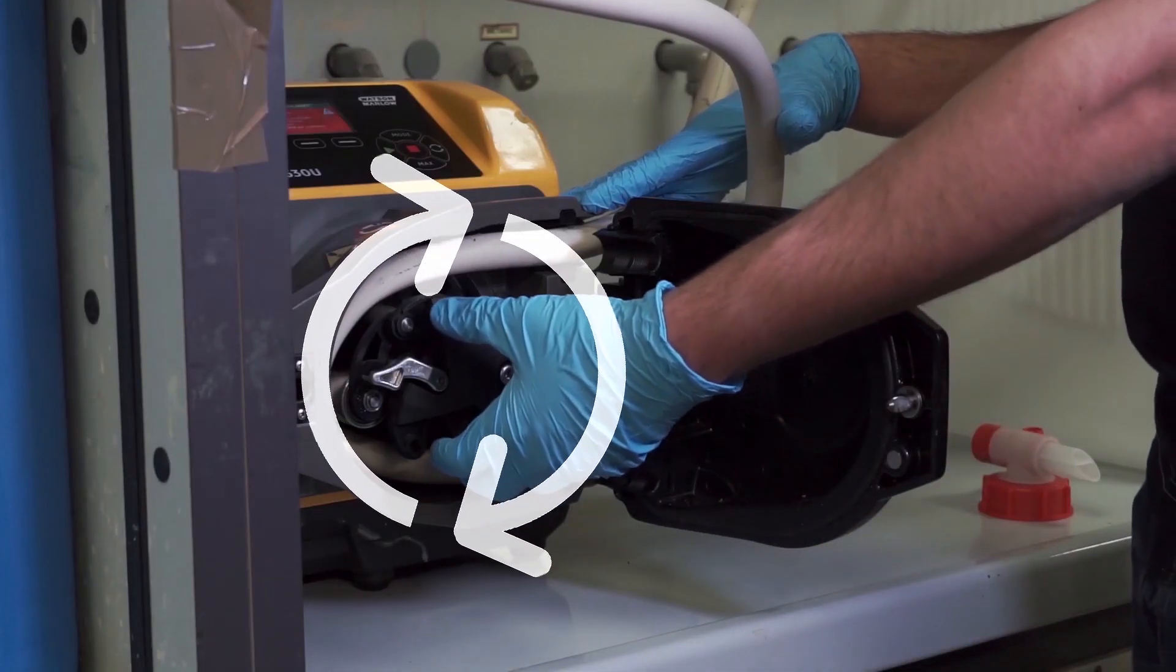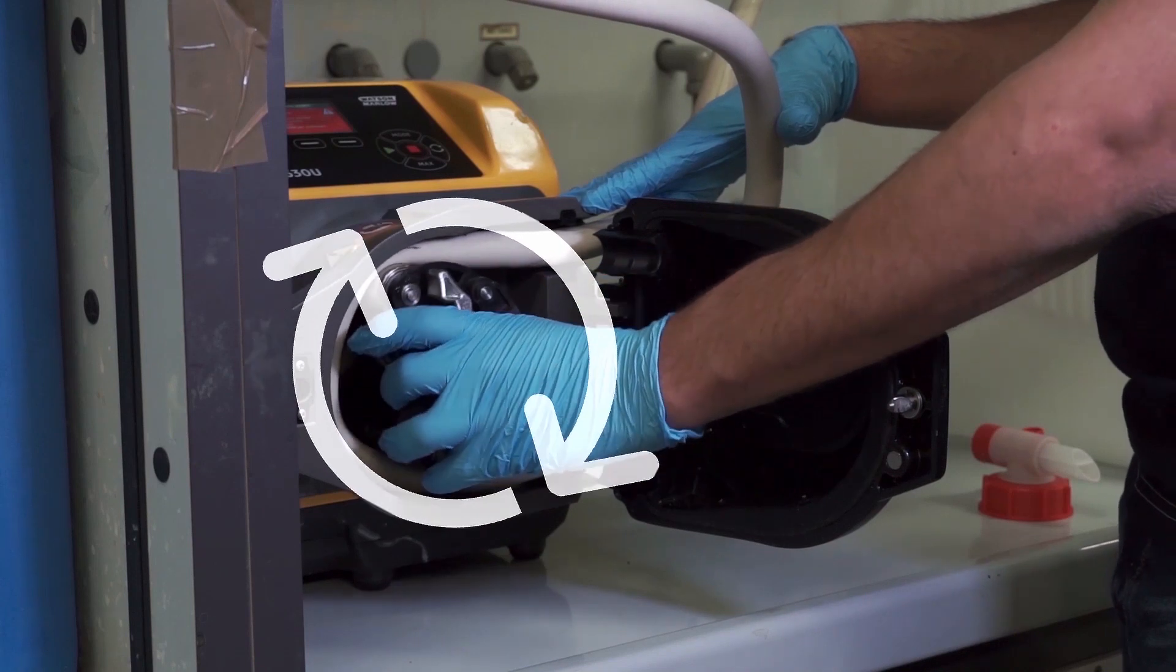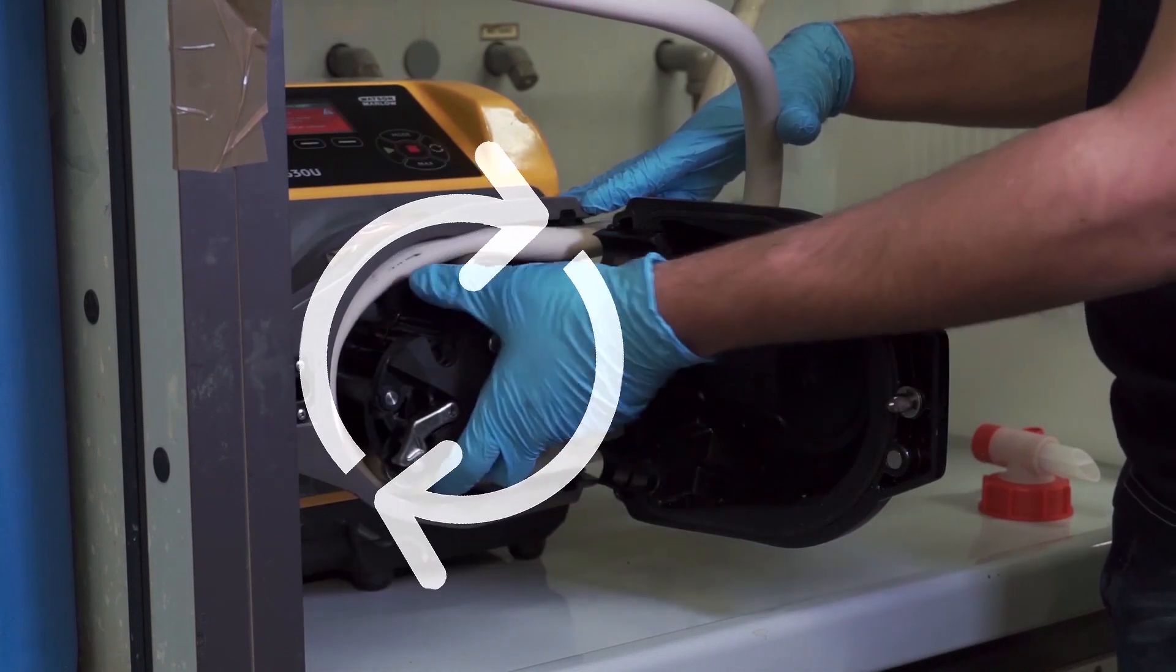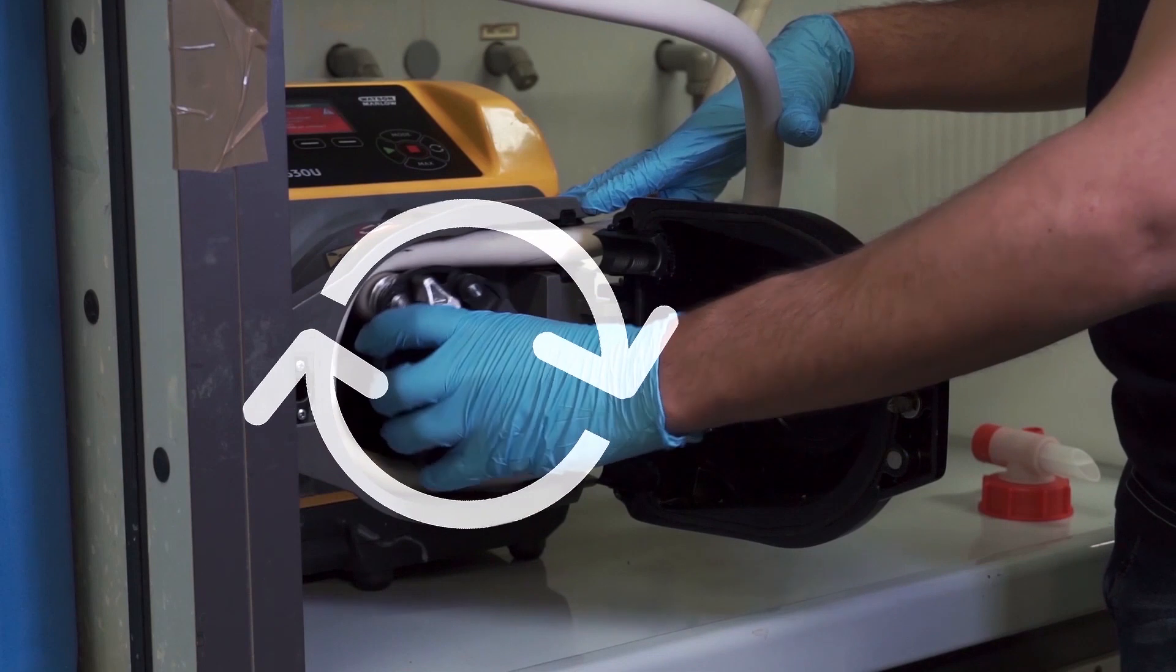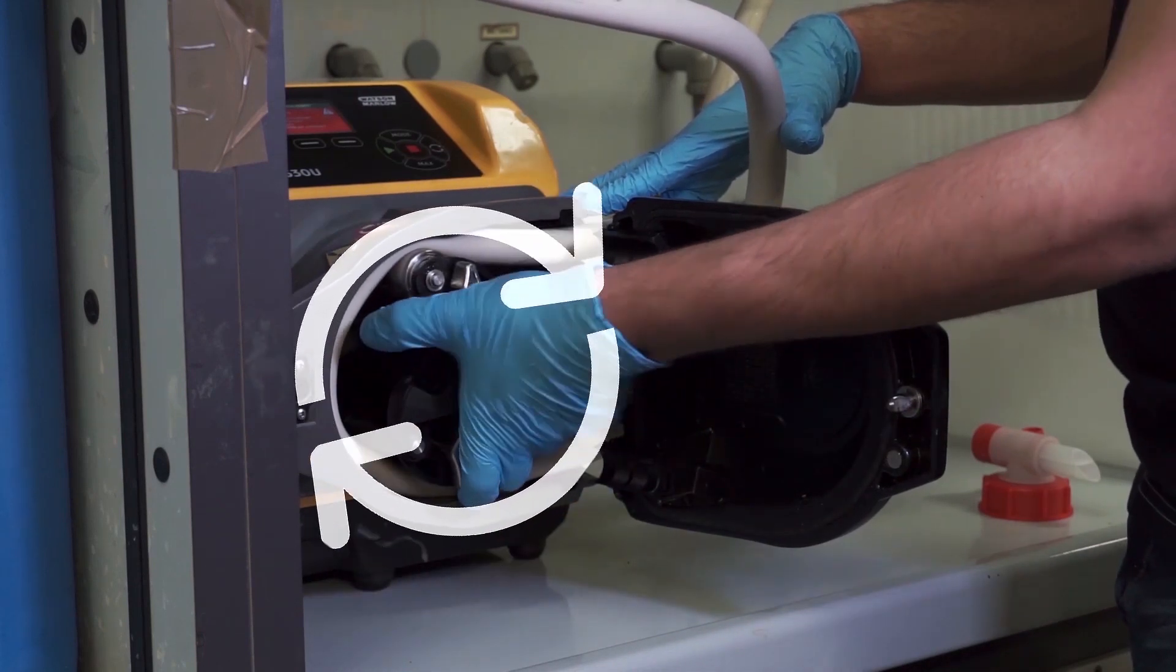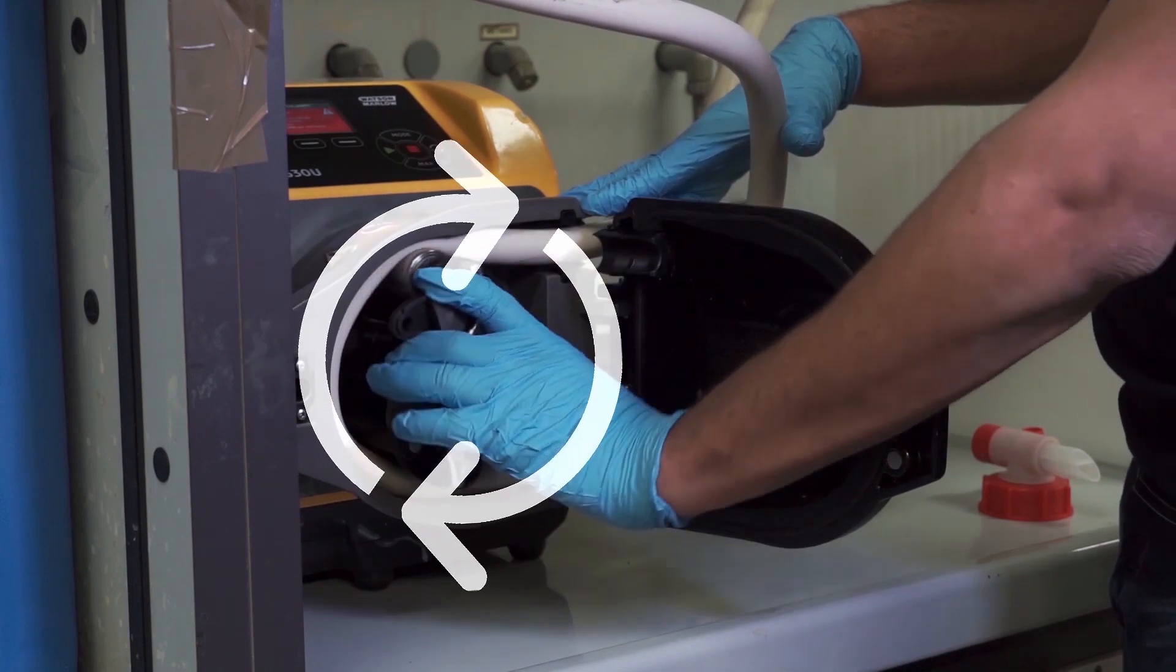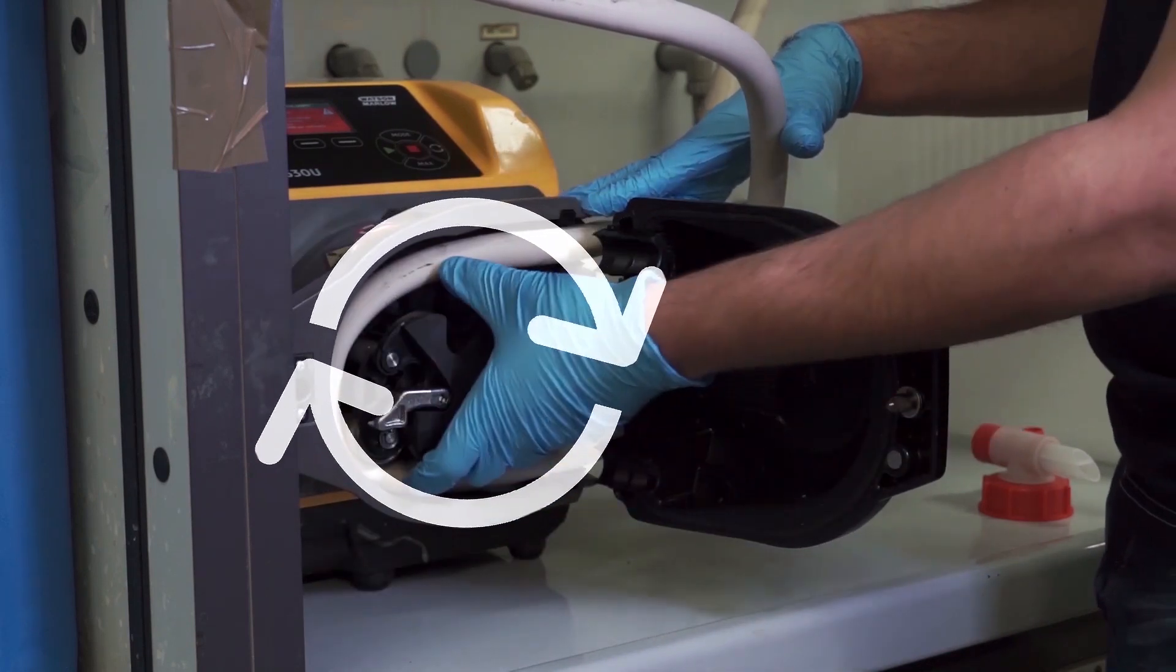In order to transfer the formulation released by the World Health Organization to a continuous process, it is necessary to set the flow rates of the aqueous and alcoholic solutions. Depending on the available pumps, it is possible to produce different amounts per hour of disinfectant liquid as shown in the attached document.